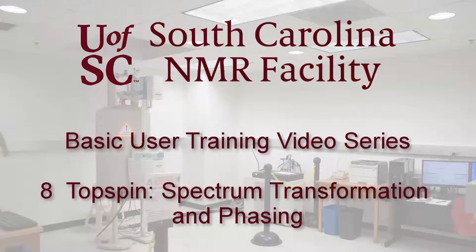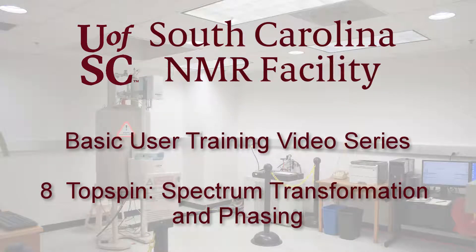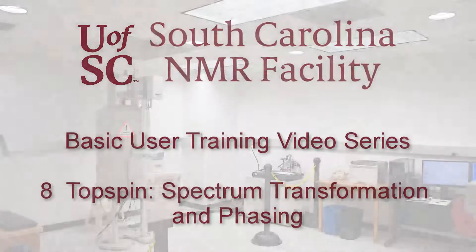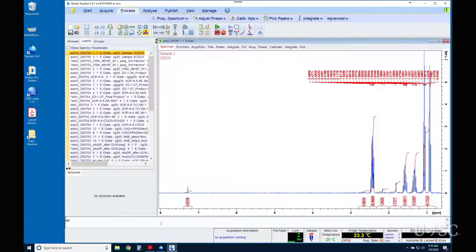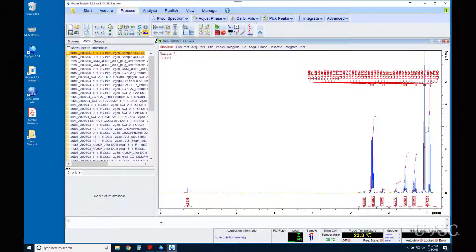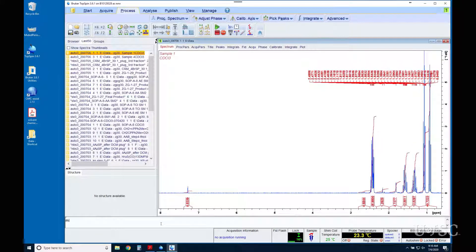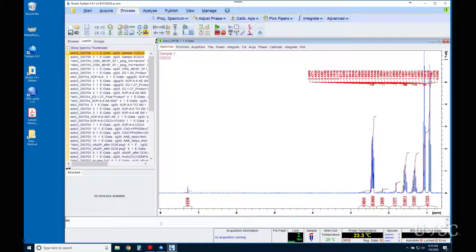In this video we will cover how to re-transform NMR data and how to phase 1D spectra. In a typical workflow, these should be the first steps in processing your results.